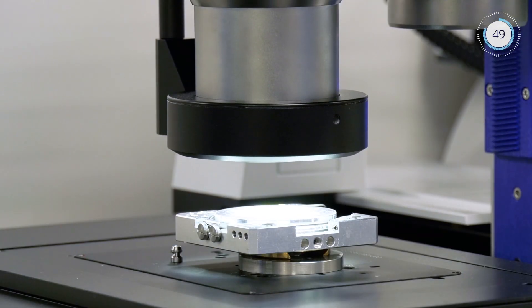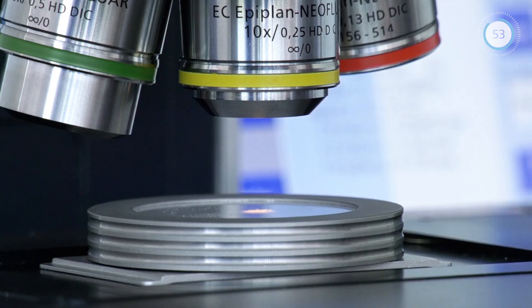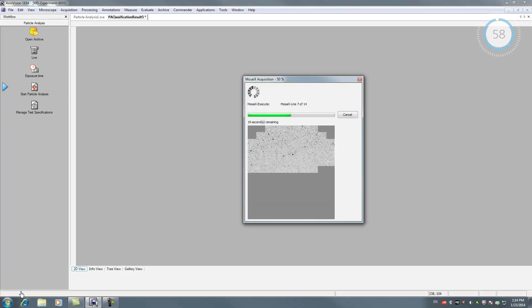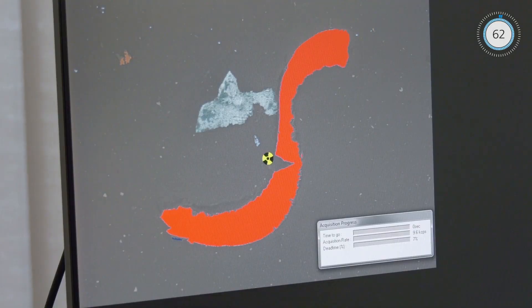Detect particles from any position on the filter quickly and accurately with continuous autofocus. Perform complete filter scans in minutes by implementing automated acquisition.